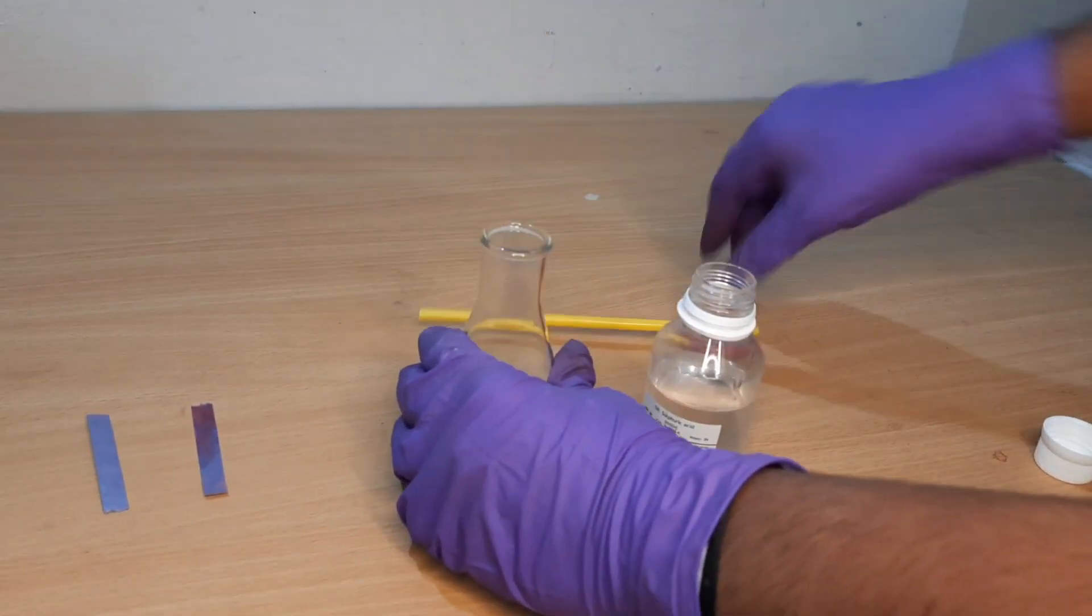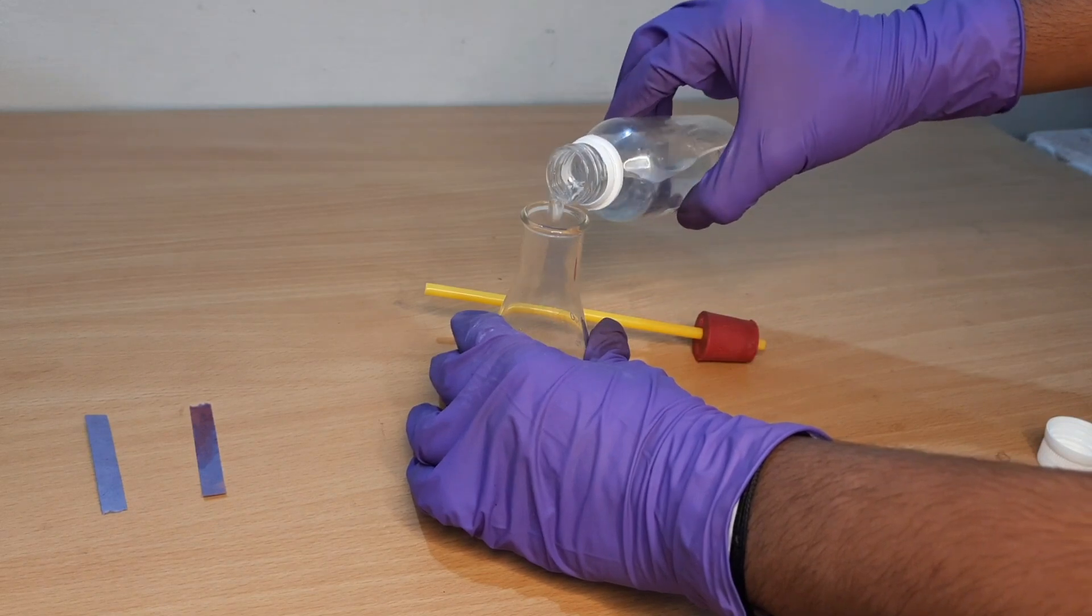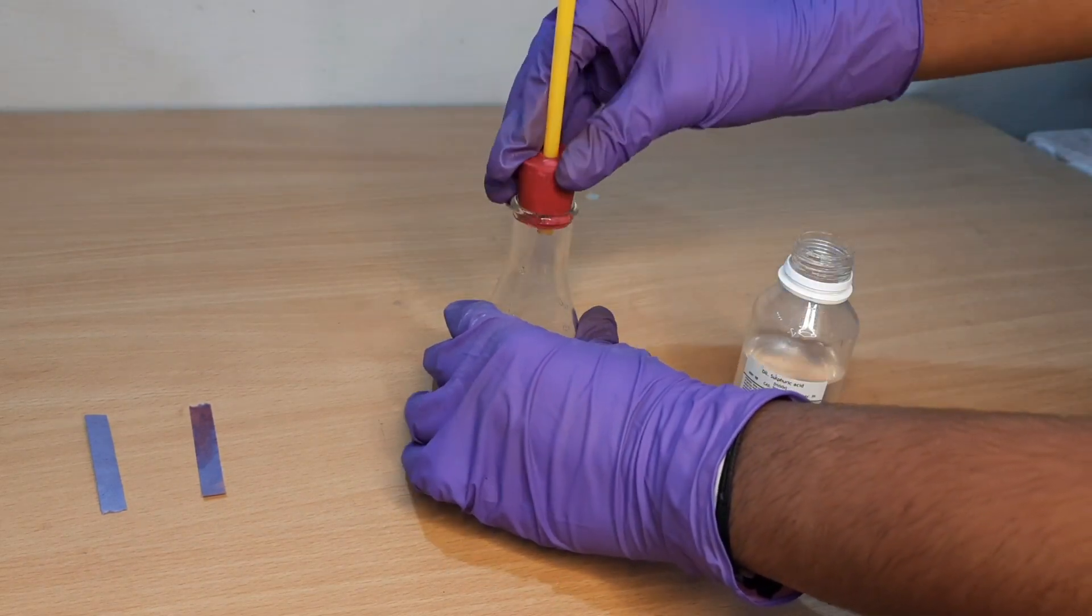Sulphuric acid reacts with sodium chloride to form hydrogen chloride gas. Hydrogen chloride gas starts coming out of the open end of the glass tube.